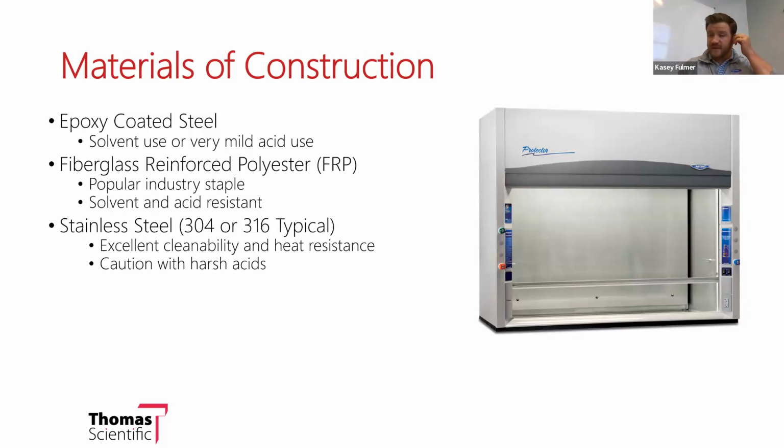Obviously, if you were heating something, whatever that something is, if you were to burn, melt, or warp your liner, it could potentially compromise your fume hood. So a stainless steel hood is very conducive to handling heat applications because it has high resistance in those factors. You just want to be careful, because sometimes you have a customer that hears 304 or 316 stainless steel, and they think, oh, well, yeah, that's a great material.